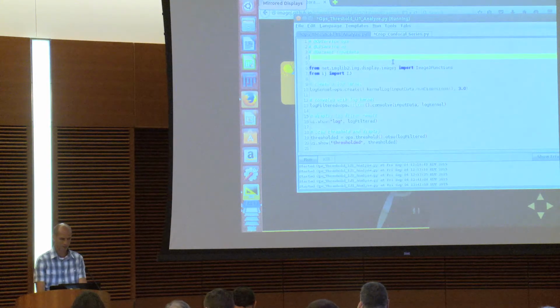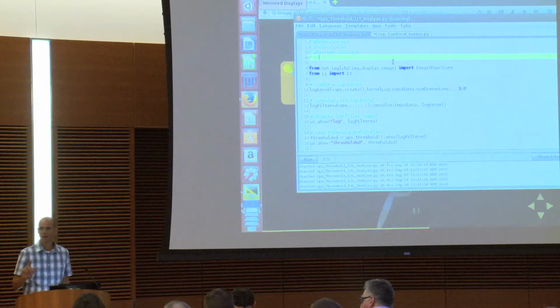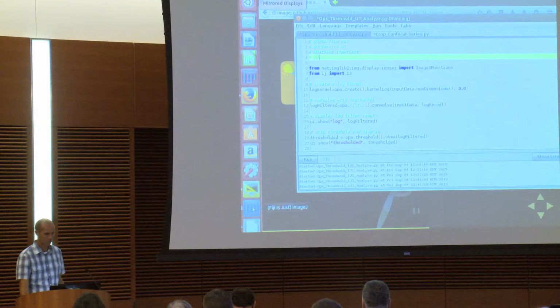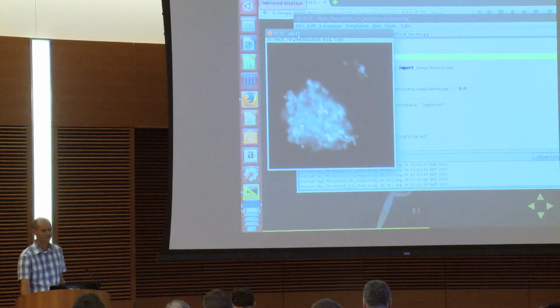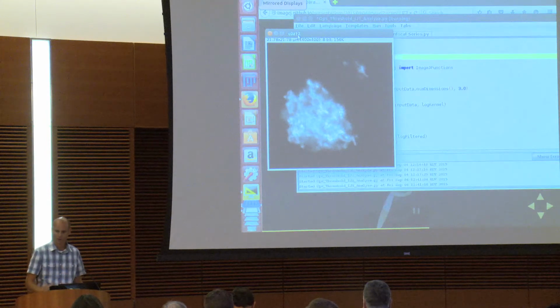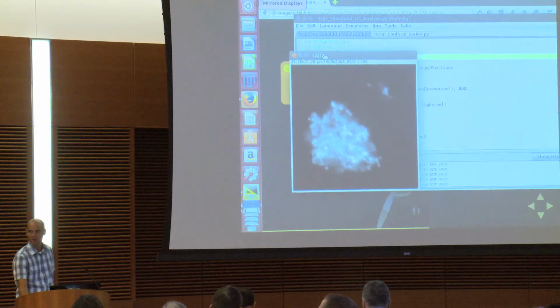What I'm going to do here is use my parameterized scripting style. Which sample image is this again? The image that we've been using was created from the first script. The easiest thing to do, if you don't have it up anymore, is close every single image, run the first script, and then you should get this image.